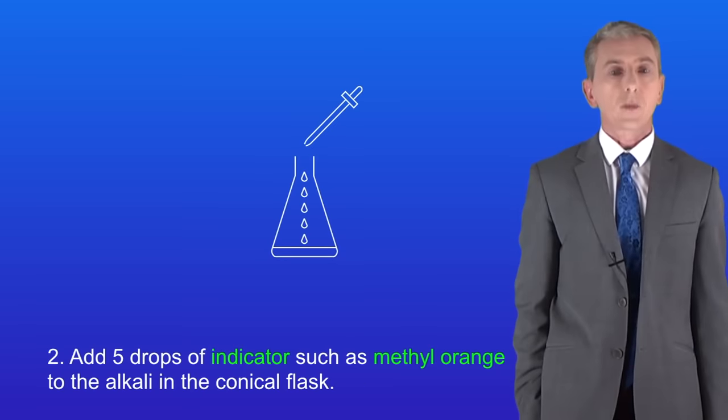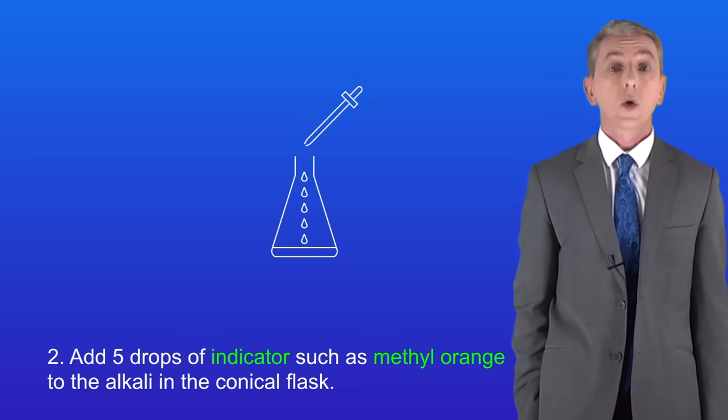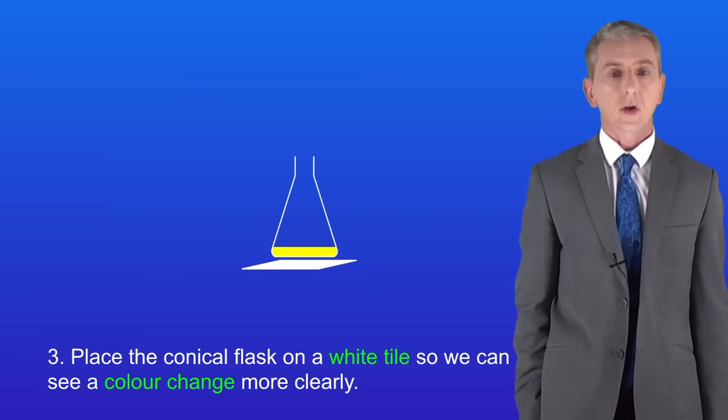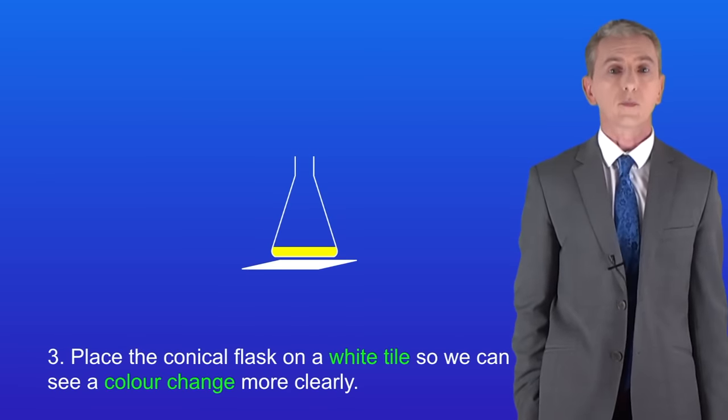Next we add five drops of an indicator such as methyl orange to the alkali in the conical flask. We could use other indicators such as phenolphthalein. Next we place the conical flask on a white tile so we can see a color change more clearly.